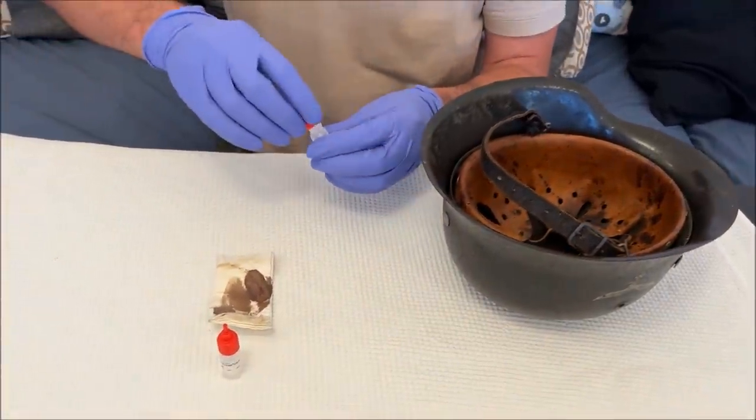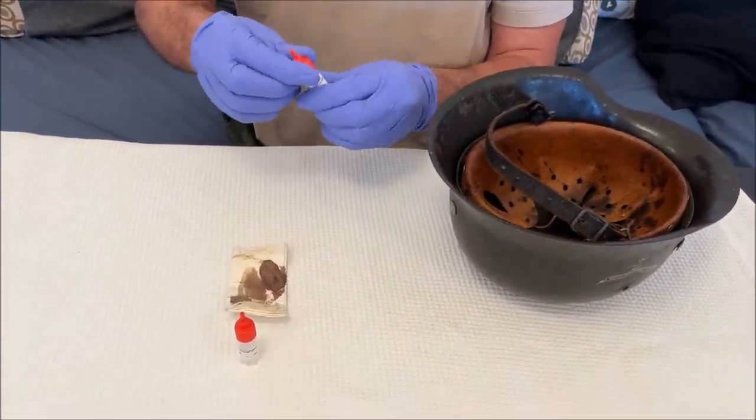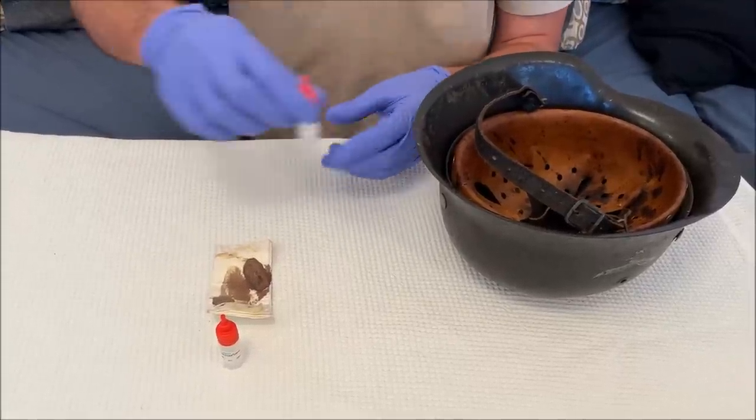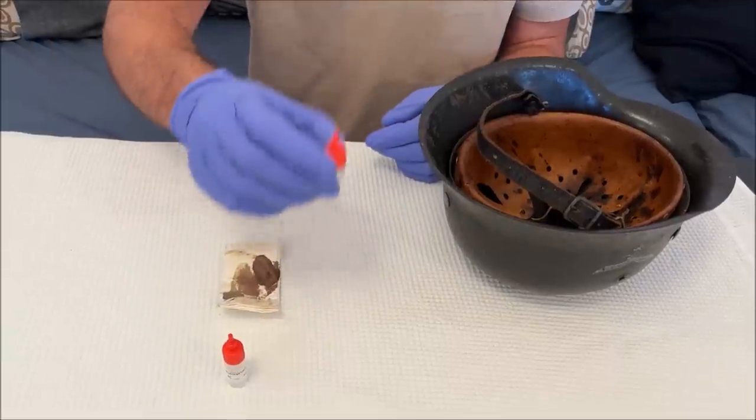In the guide they say that for old blood you're supposed to wait up to 8 or 12 hours, so we'll just let this rest and do the rest tomorrow.